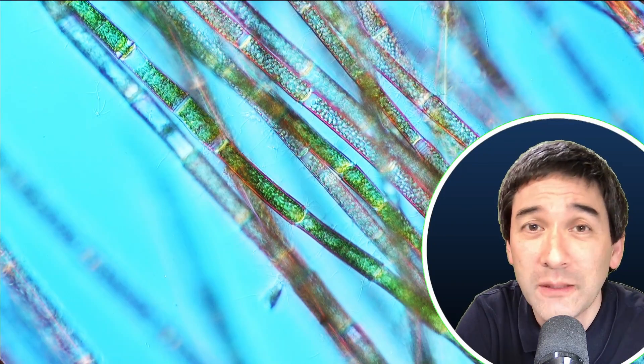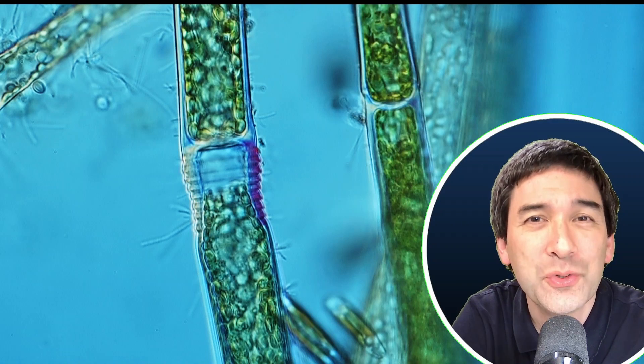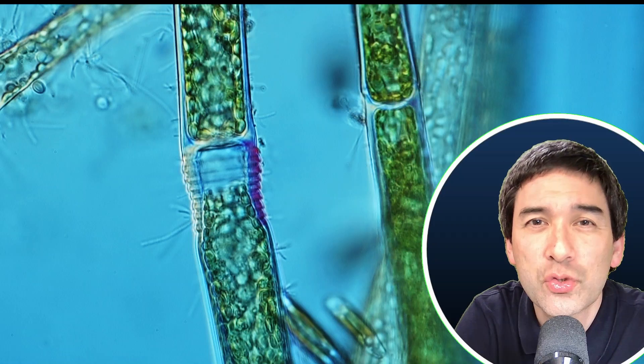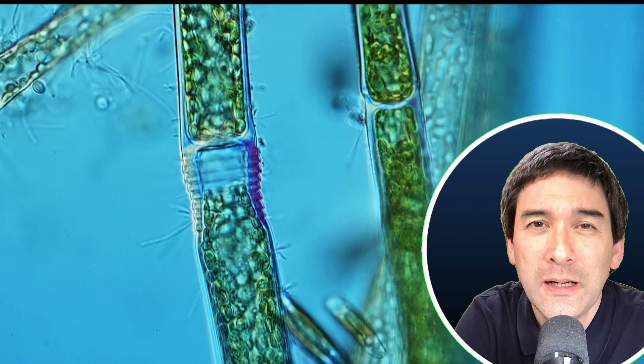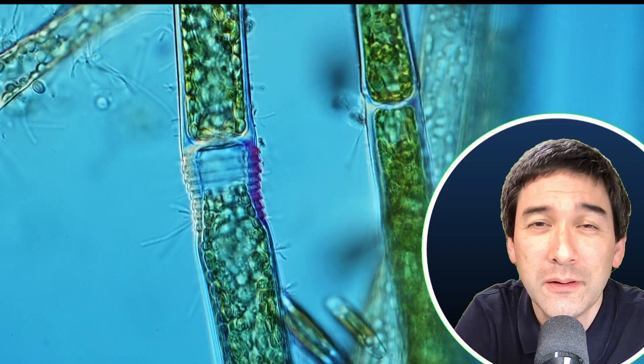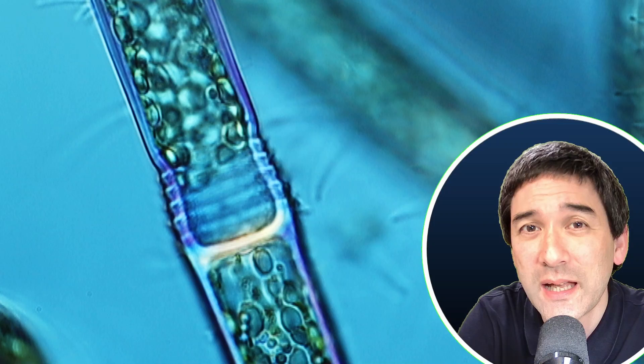So first sight, clearly filamentous algae, but what type is it? And this is actually where it starts to become a little bit difficult, but I did find those interesting cells here that contain those ring-shaped structures in the cell wall on many of those cells. It's kind of strange a little bit and here we have a close-up here.